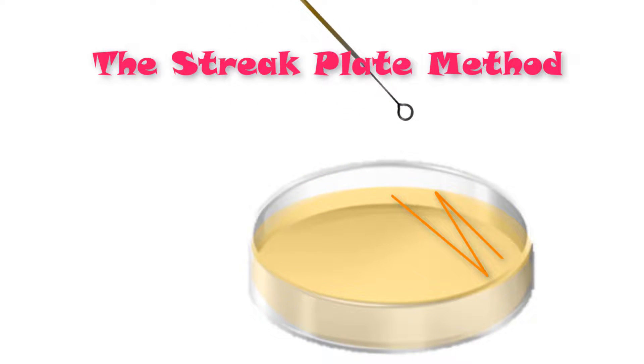With our agar plate, we can use the streak plate method to dilute our sample enough to be able to grow individual colonies.